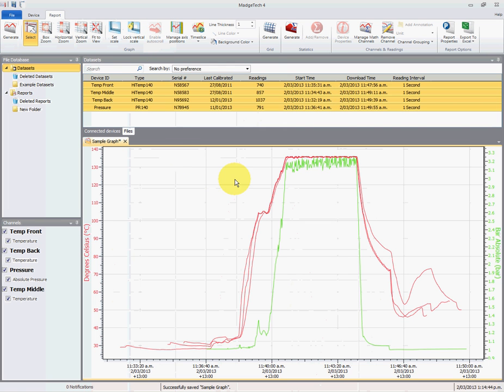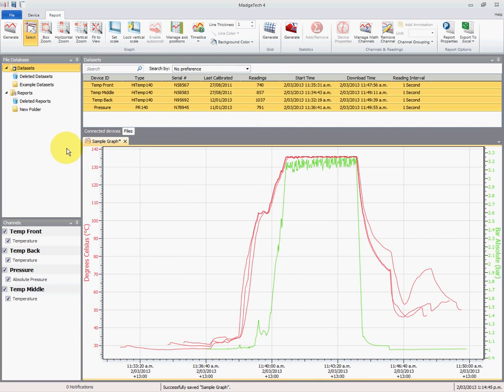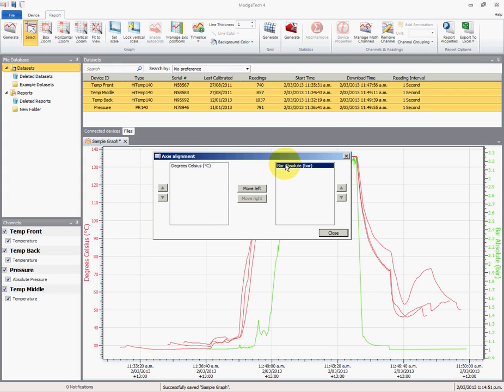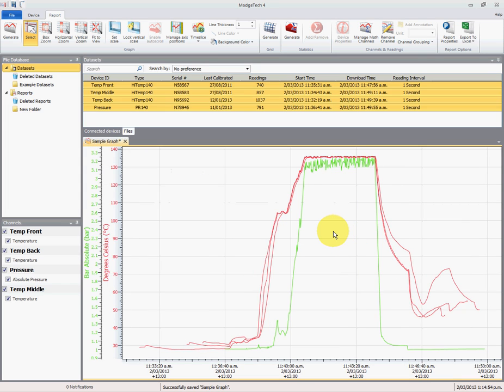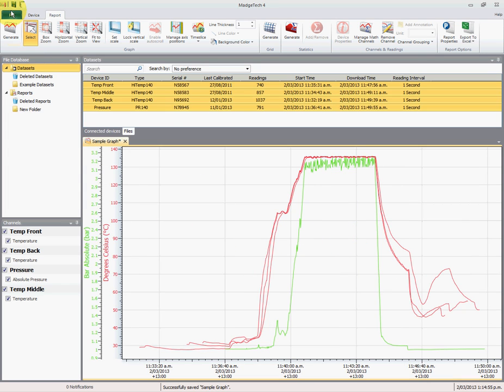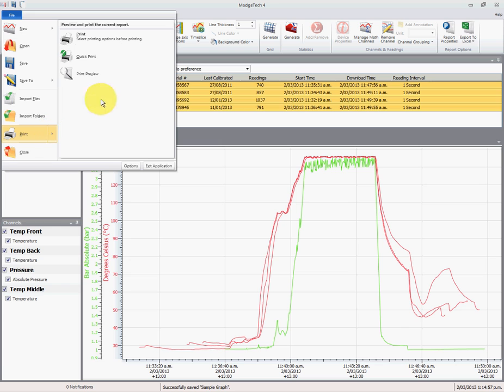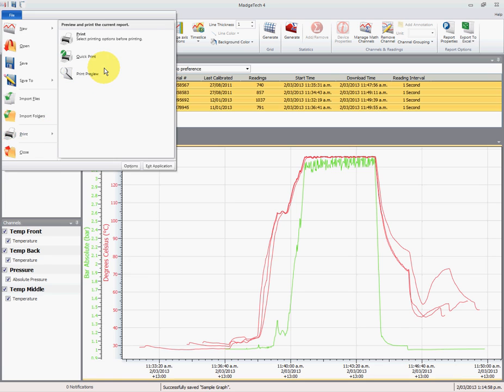So we'll close the print preview and up here we'll see manage axes positions. Quite simple: select pressure and move to the left and close. If we now go back and have a look at the print preview, you'll see that that's not obscuring any of the data.